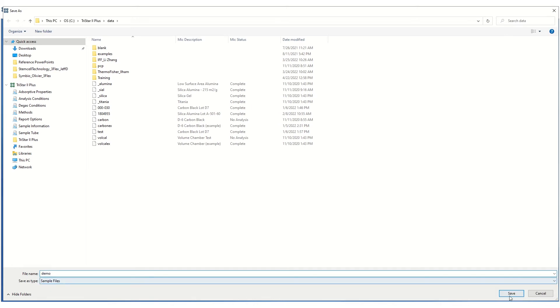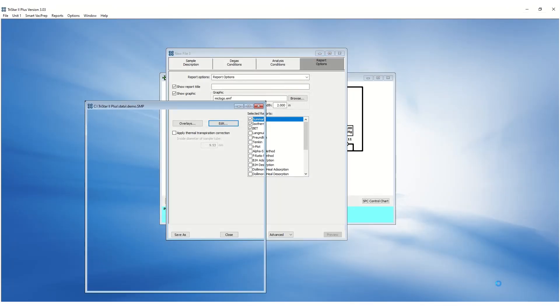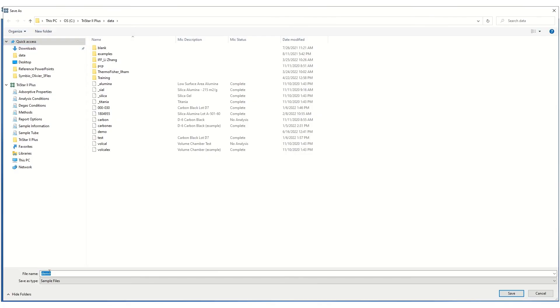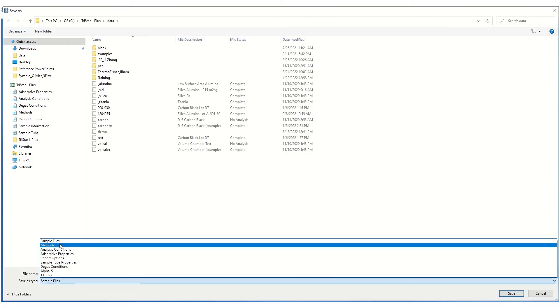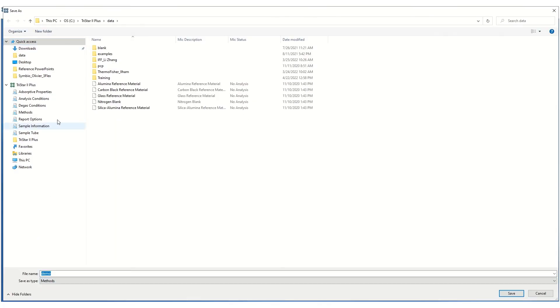Additionally, there are some useful features for a quick sample setup in the software. If you would like to use this sample file setup for the next analysis, you can save this file as a method and save under the Methods folder.